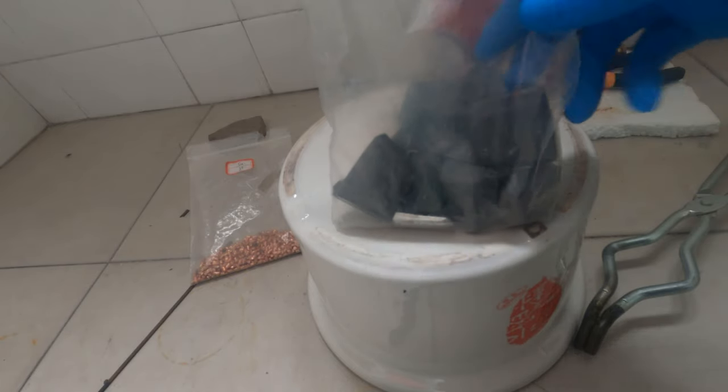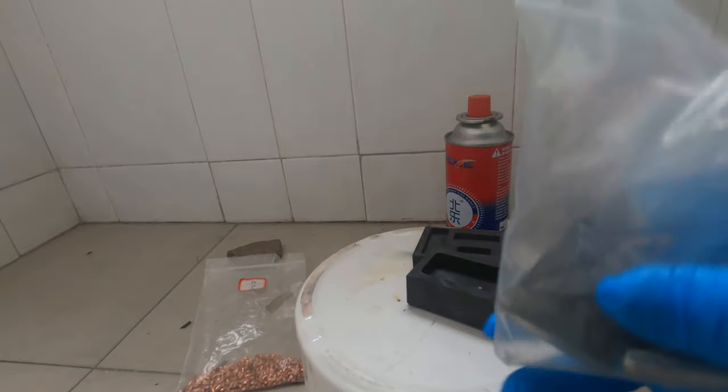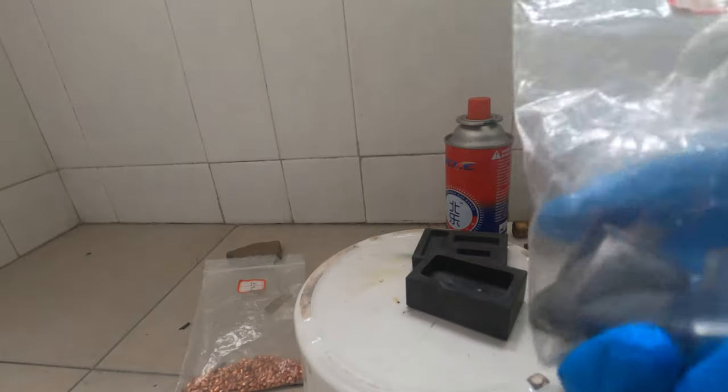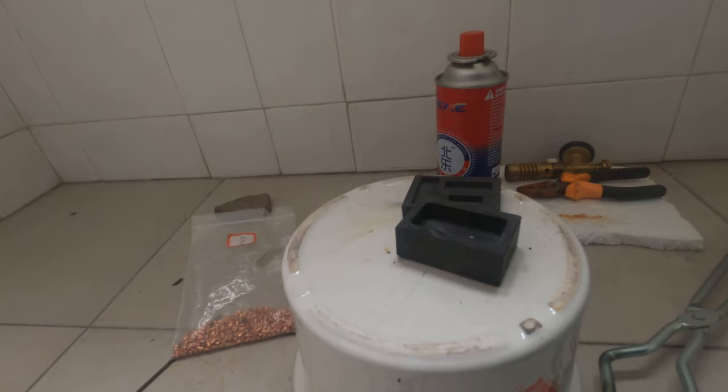First thing we need to do is to cast a lead bar. Lead has a low melting point of 330 degrees C, so just by using a butane torch, I can melt it down. I have some lead chunks here.